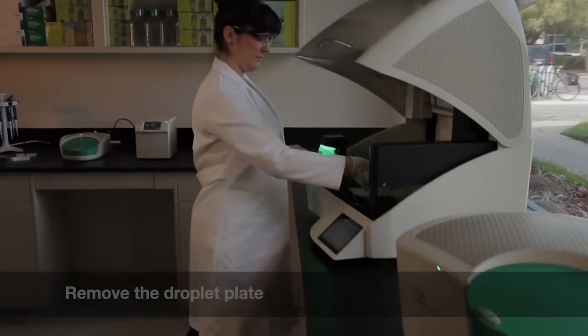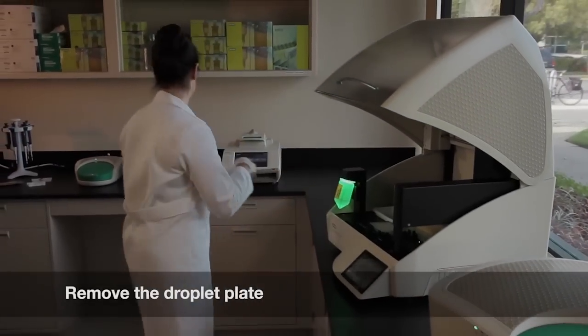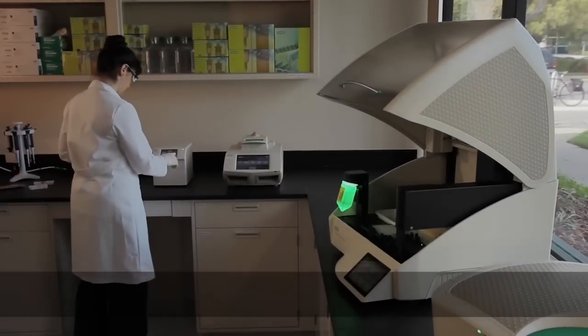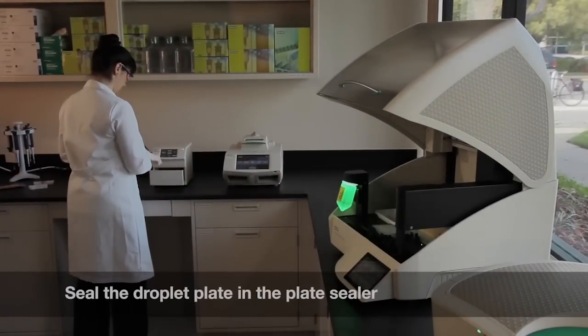Remove the plate of droplets from the AutoDG and seal it with a PCR plate sealer.